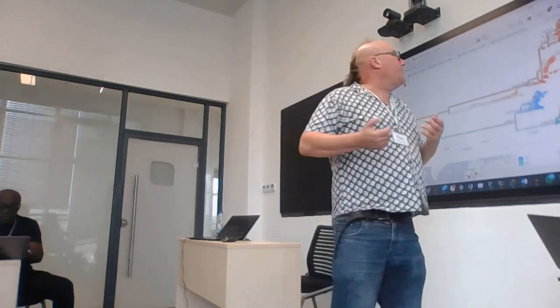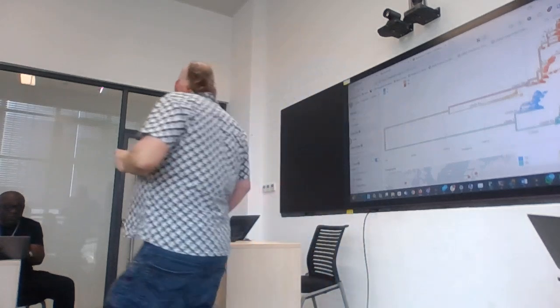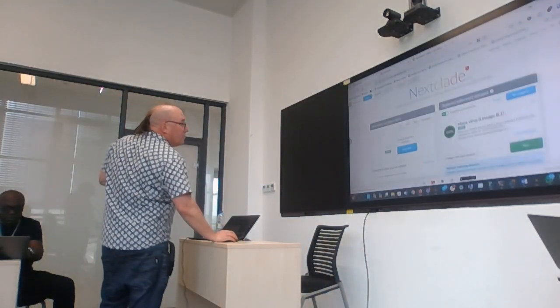Maybe over time, we will say that there's a clade 1C or something like that. We don't have names for it yet. So it chose, based on our sequence, B.1 as the reference. So let's go do some analysis.